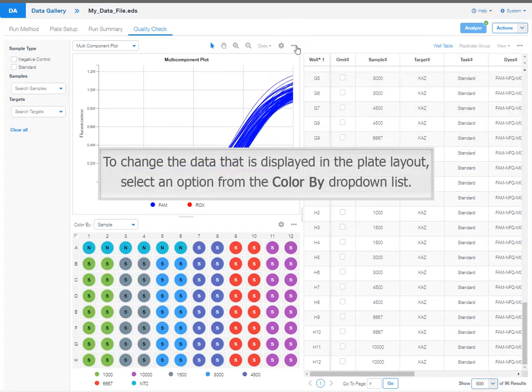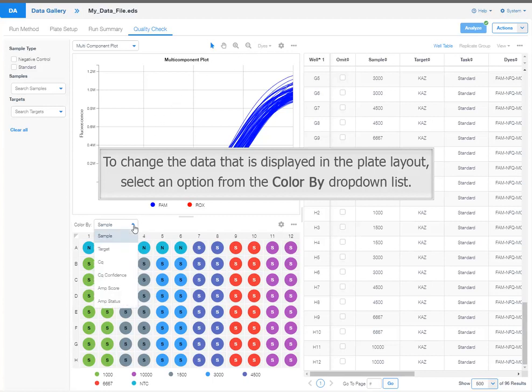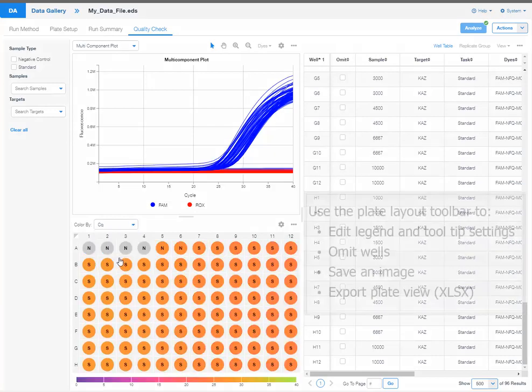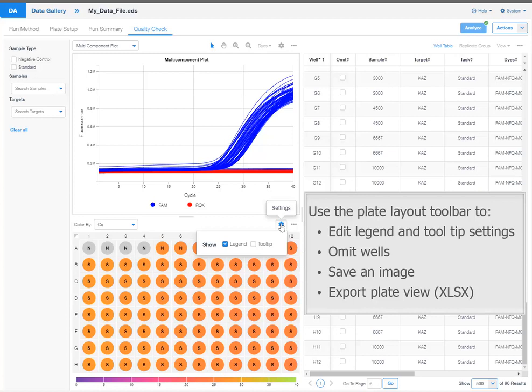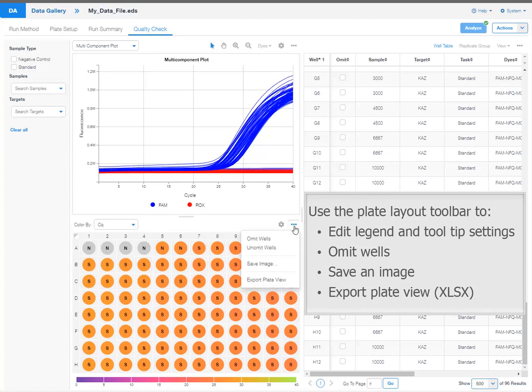To change the data that is displayed in the plate layout, select an option from the color by drop down list. Use the plate layout toolbar to edit legend and tooltip settings, omit wells, save an image or export a plate layout view file.